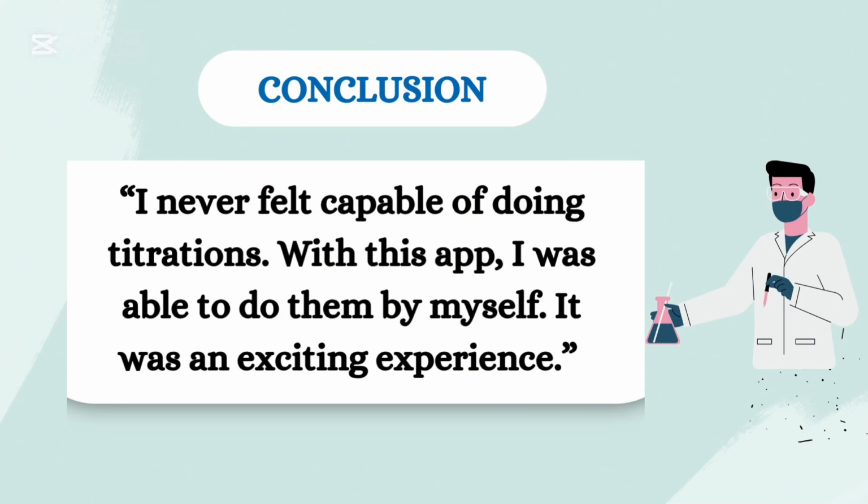Additionally, it allows more students to engage in scientific processes in a deep, practical, and precise way. This approach can be replicated in other analytical techniques and lay the foundation for truly universal science education.